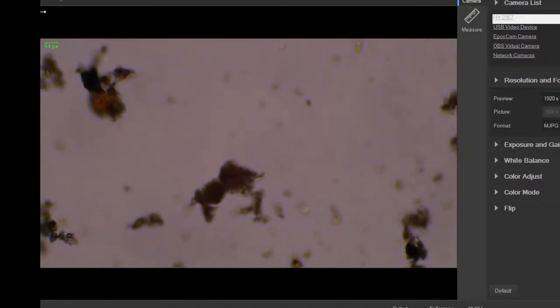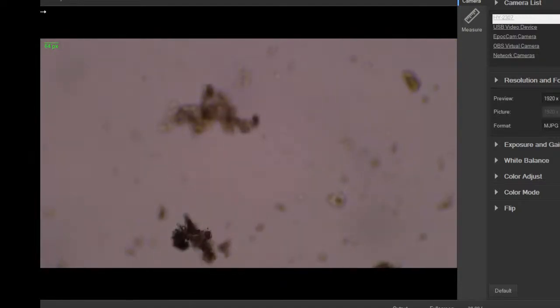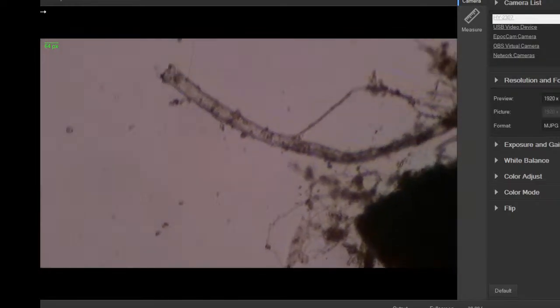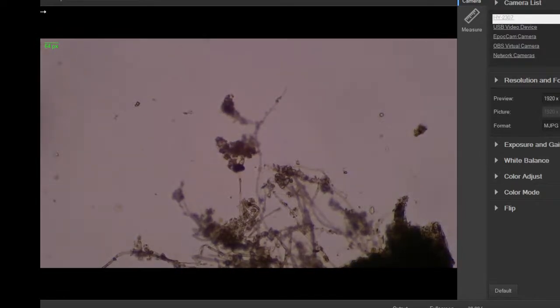Man, oh man, there's some good stuff here. This is why I usually cover the whole slide if I can. As you saw, different areas of the slide are completely different little critters. There's another little character, stuck in a little debris forest.